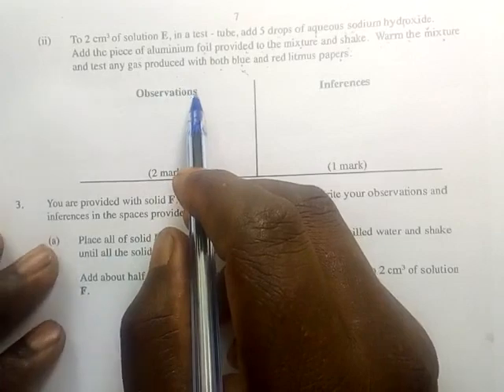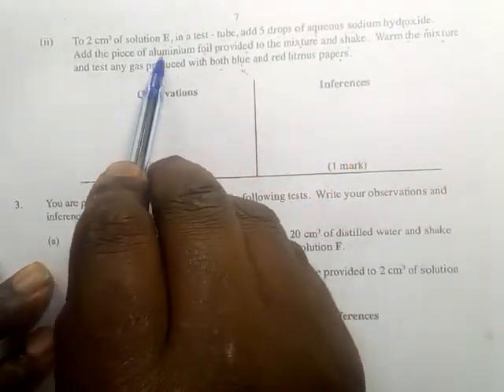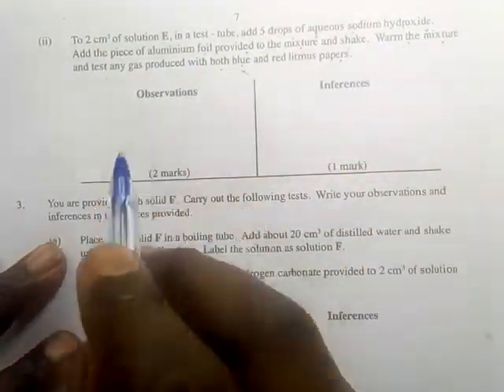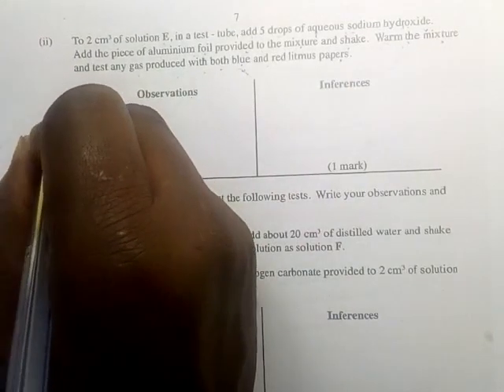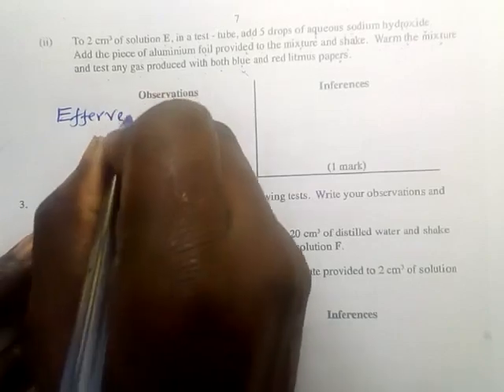So what is the observation when you are mixing sodium hydroxide with aluminium foil and then heat? What is observed? Effervescence first occurs because a gas is produced.